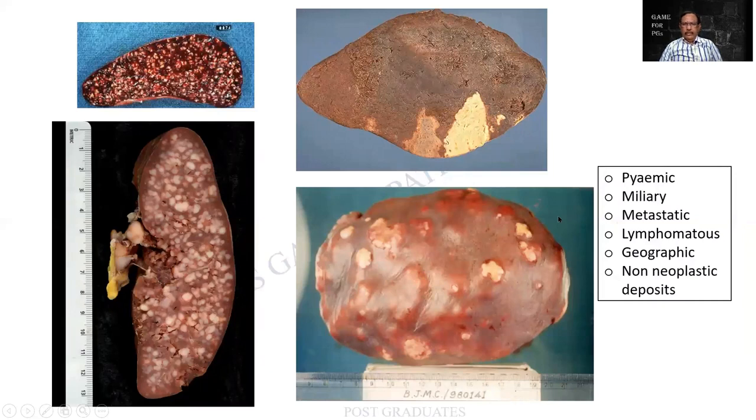An infarct. Is it clear? An infarct can be an area of localized necrosis caused by the sudden, complete and irreversible occlusion to the vascular flow. And this is what I had mentioned earlier. Whenever we see multiple nodules, this is fairly regular, so it need not be an infarct. But if it is going to be irregular like this, I will have to think of multiple abscesses or infarcts. Multiple infarcts can be happening in conditions such as a sickle cell anemia, where there can be repeated obstruction.